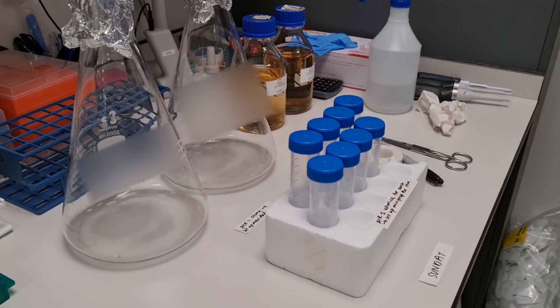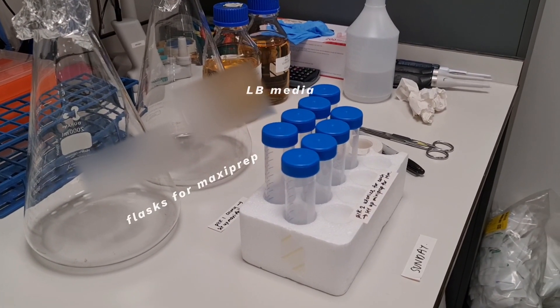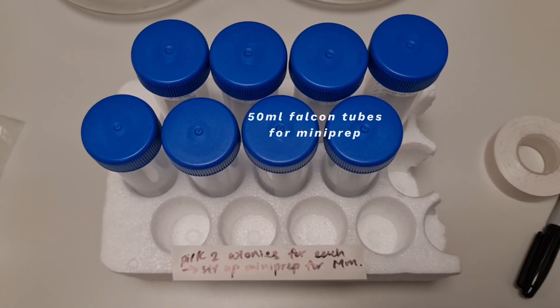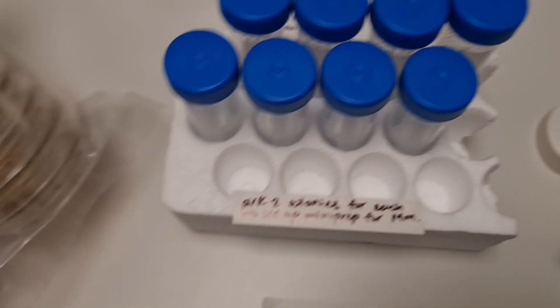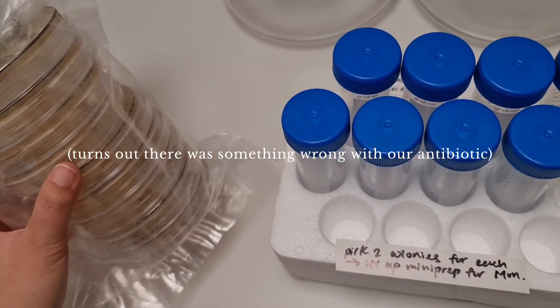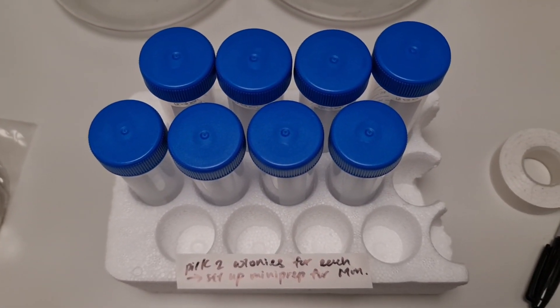So I've basically set up a few flasks here with some LB media at the back on Friday evening just so I could do everything quickly on the weekend. Here I've actually set up some tubes to do some mini preps. Unfortunately the bacteria that we've cloned here — nothing really grew — so I won't be doing this, but we'll be doing the maxi preps instead.